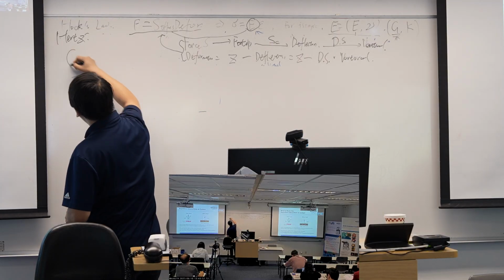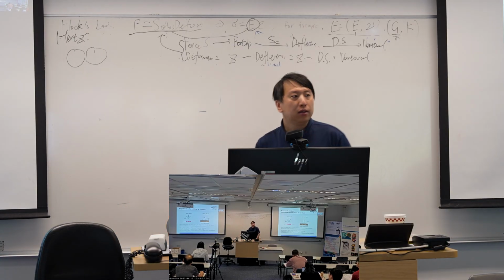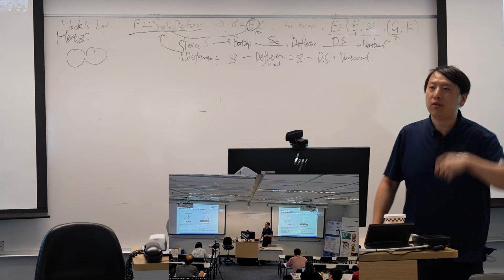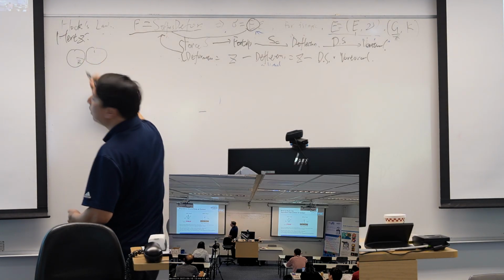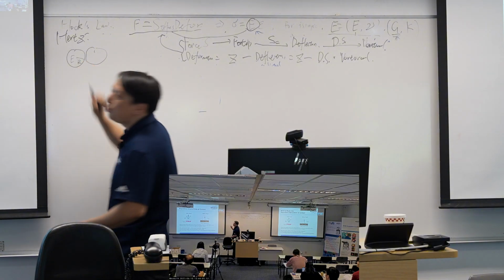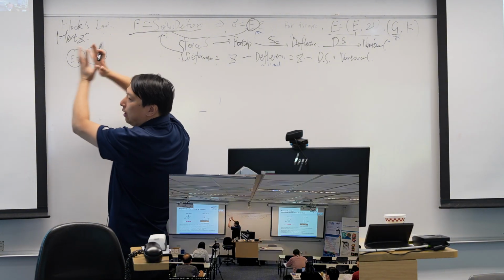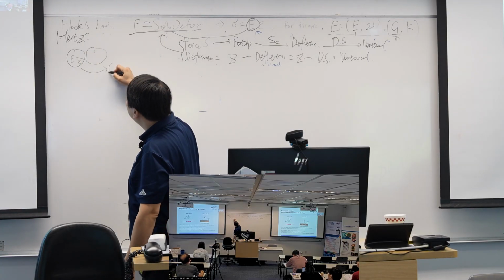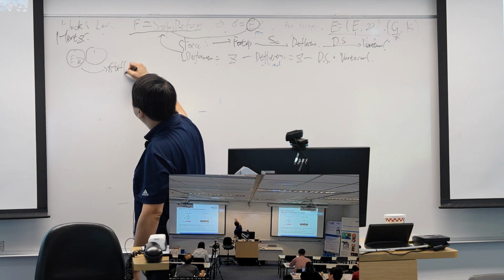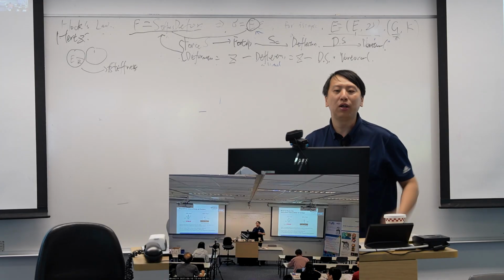So we have two spheres. These two spheres are uniform. That means each has a defined radius and a defined modulus. His key idea is we compress these two spheres together and ask what the stiffness looks like. That's his total idea.